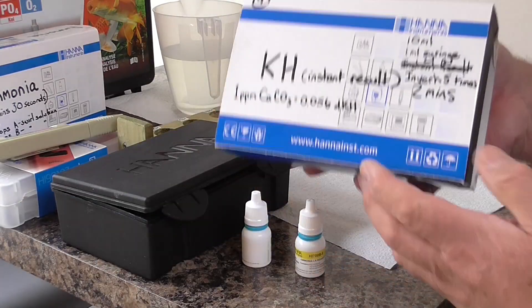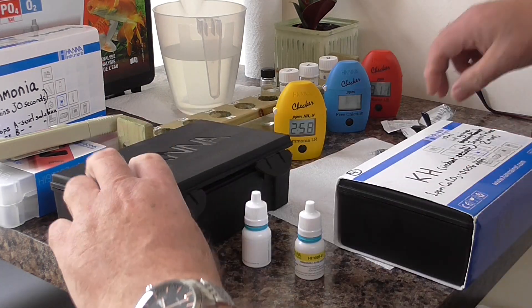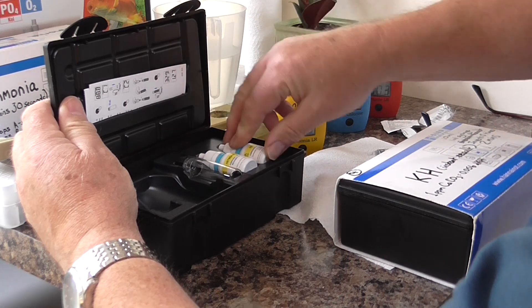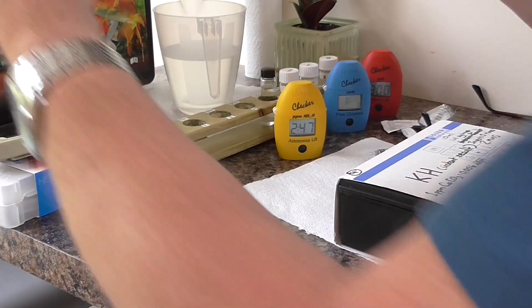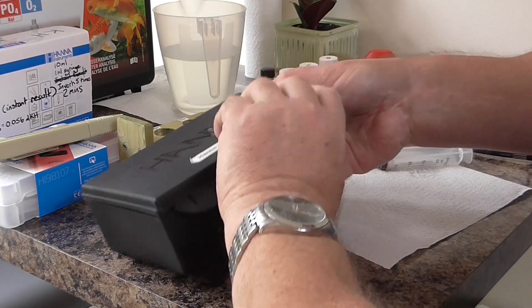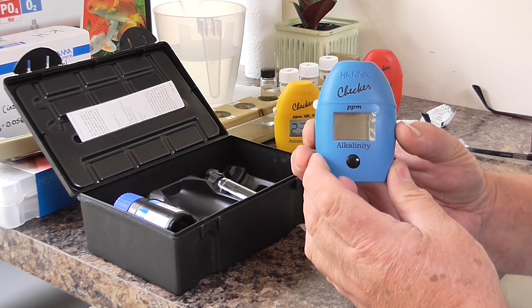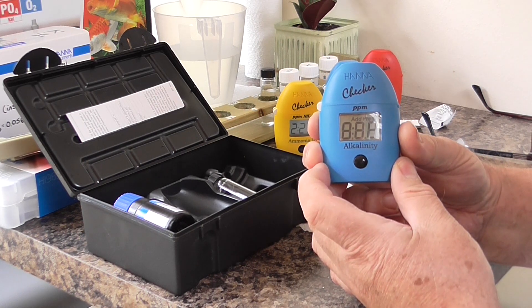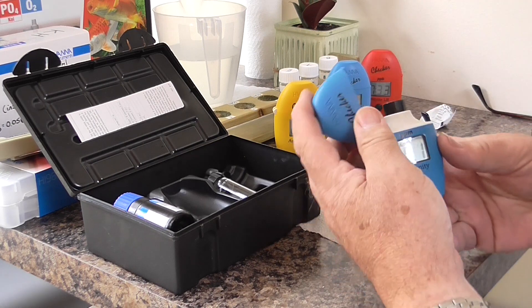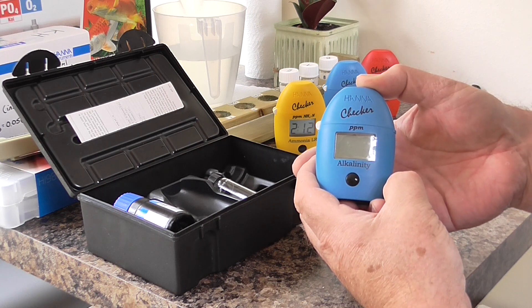On to the last, which is for KH or alkalinity. The checker reads alkalinity in parts per million. Switch that on and it's waiting for the pond water. Put the clear pond water in, shut the top, press the button, and wait until it tells us C2.